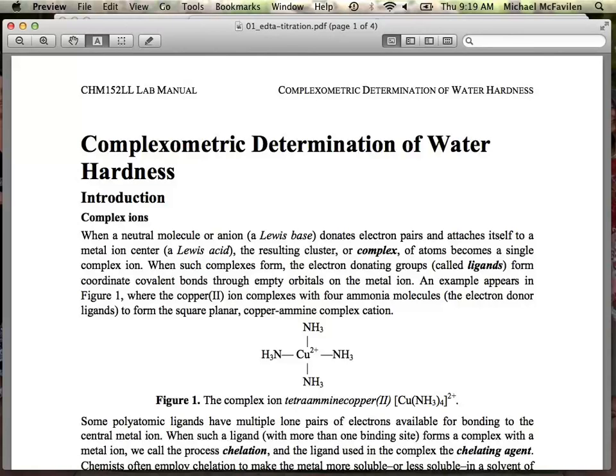So what we're looking at today is going to be what's known as that fun sequence of titrations. Okay? 90% of the labs that we're doing in 152 are all titration labs. So you're going to be pulling out the burettes and measuring things really carefully with the burettes, looking for color changes, that kind of stuff, which I think you did for one experiment in 151, right? So you're going to get really, really used to titrating things, right?